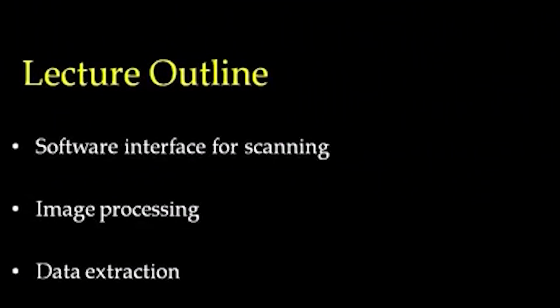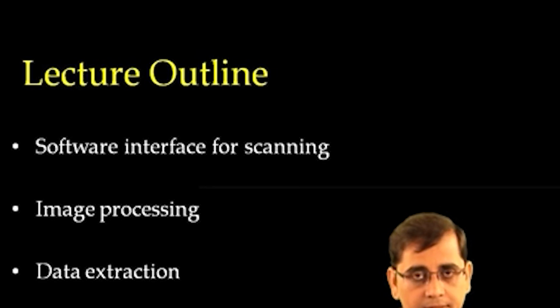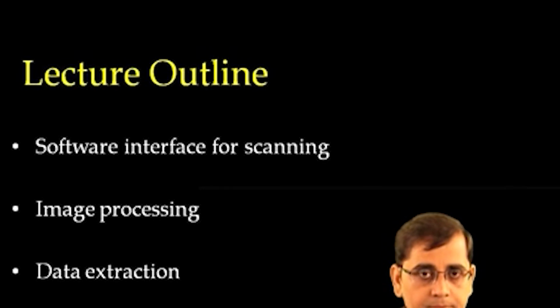In our previous lecture, we understood the vital parameters to be taken into consideration before data acquisition and scanning. Today, we will discuss the software interface for scanning, image processing and data extraction. Mr. Pankaj Khanna would provide a software demonstration for performing the scanning.